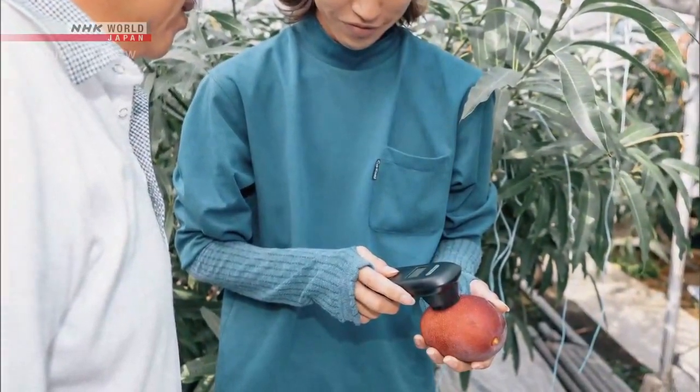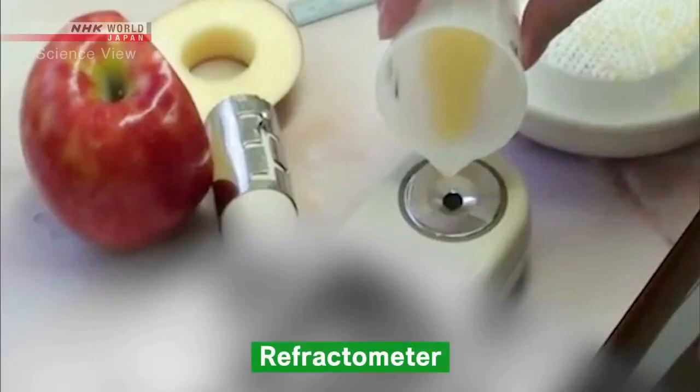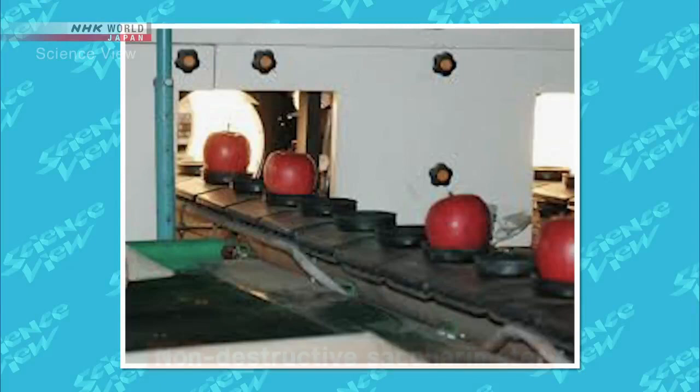But there are other saccharometers on the market too. Most of them use liquid extracted from the fruit to measure the sugar content. This is one such device called a refractometer, but to use it you need to extract the fruit's juice, so it's not very convenient for farmers. Meanwhile, large wholesale markets have non-destructive saccharometers, but the machines are quite large and expensive, making them difficult for farmers to own.